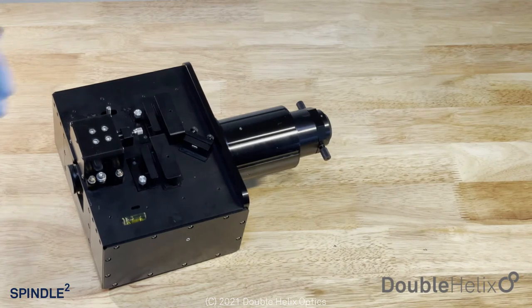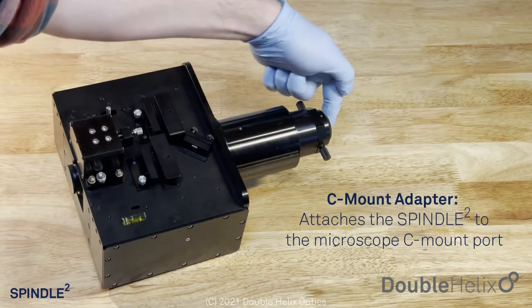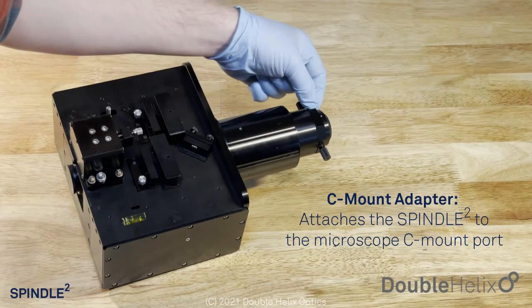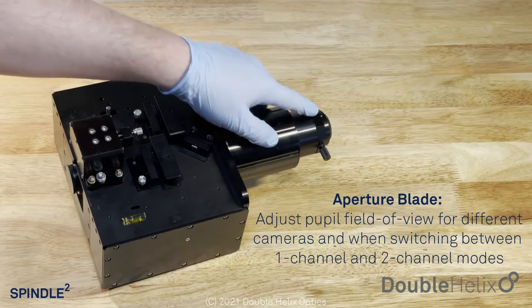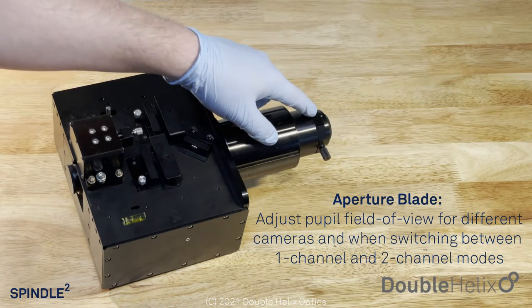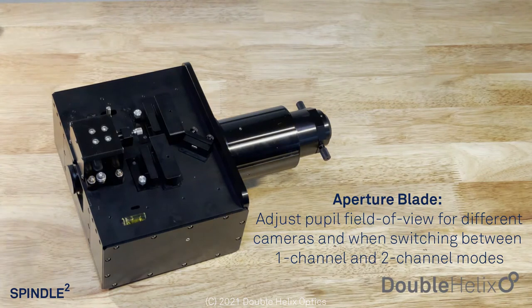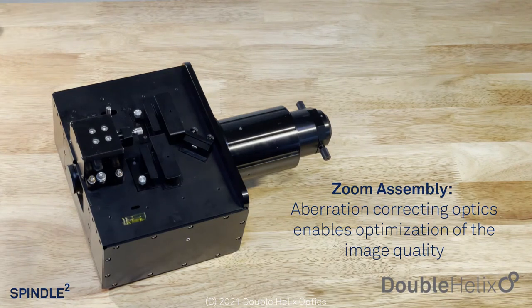To run through some features: we start with the C-mount port adapter, which goes onto the C-mount port of your microscope. After that, we have our aperture blade assembly, which allows us to control the field of view — to reduce it for different camera sizes and also when going from one-channel mode to two-channel mode. We then have our zoom assembly, which allows us to adapt for different aberrations from different microscope bodies and ensure we're placing the 4f plane right on the mask.